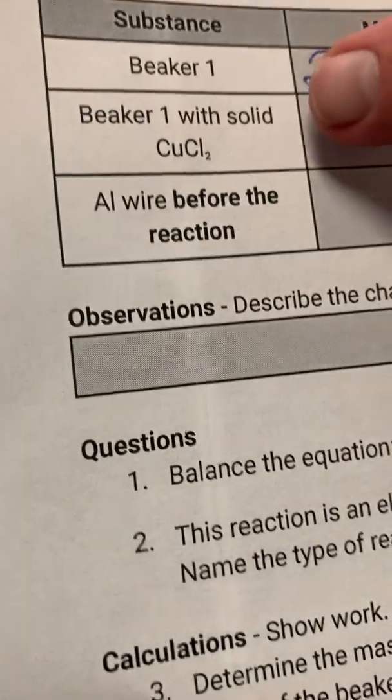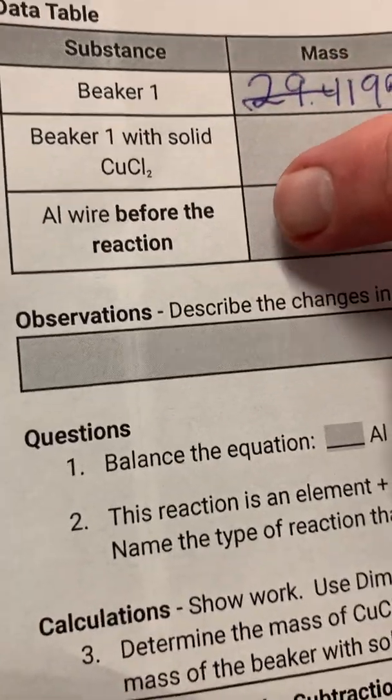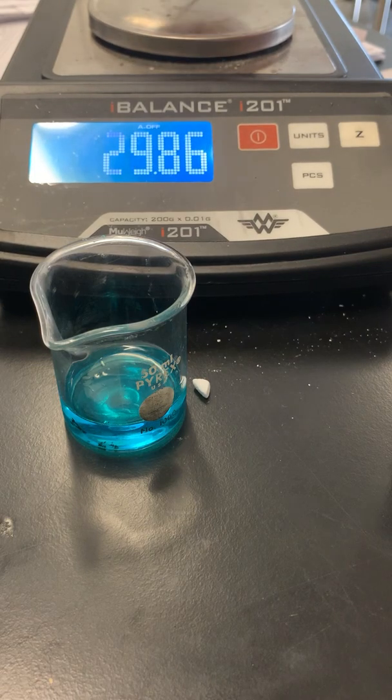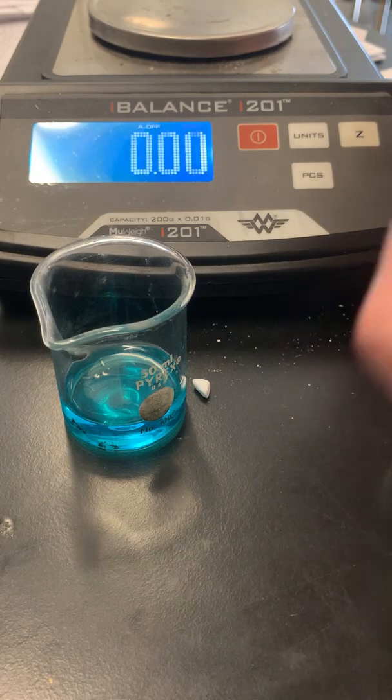We added one more, 29.43. And then the aluminum wire, and my aluminum wire weighs 0.2 or 0.19.